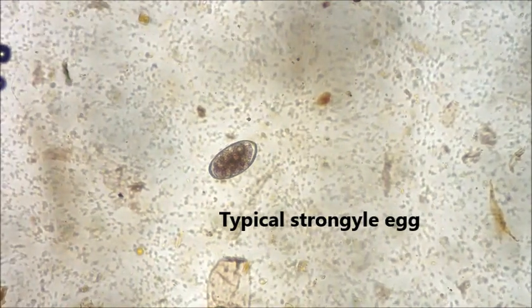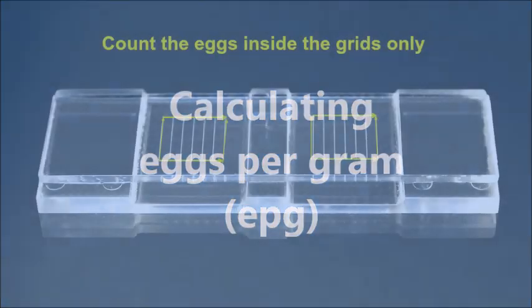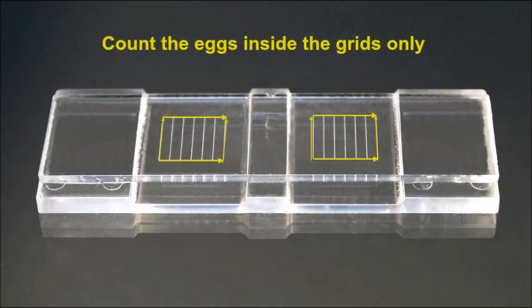It is a simple calculation to work out eggs per gram. Count all eggs within the grid lines on both sides and multiply your total by 50. Ignore any eggs that are on the outside of the grid lines, as they are not included in the calculation.